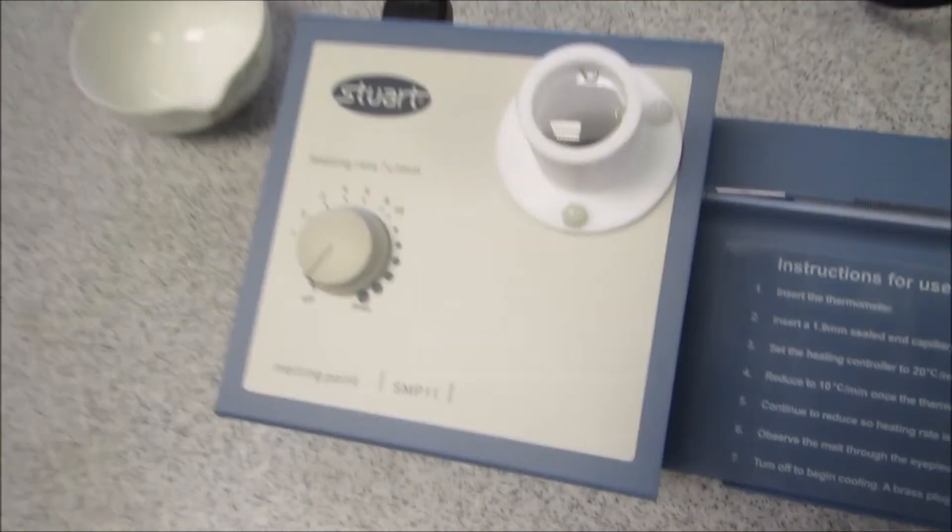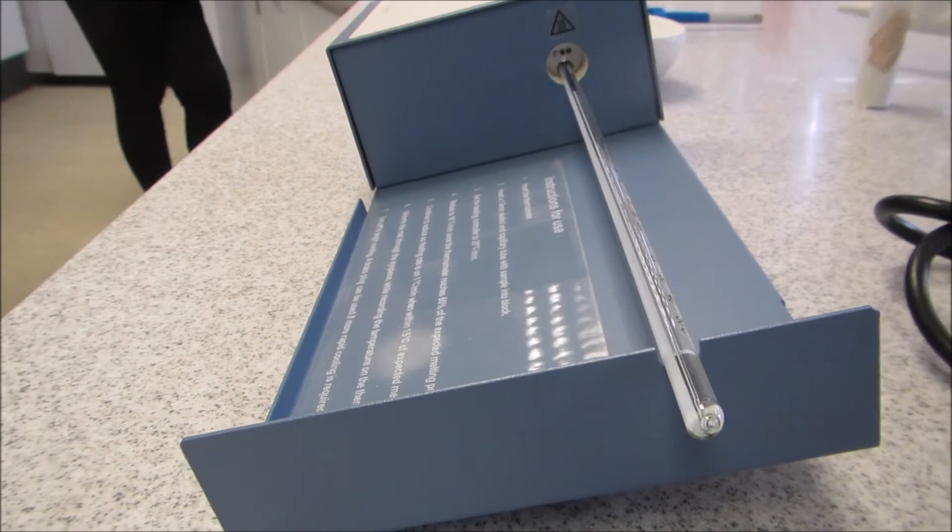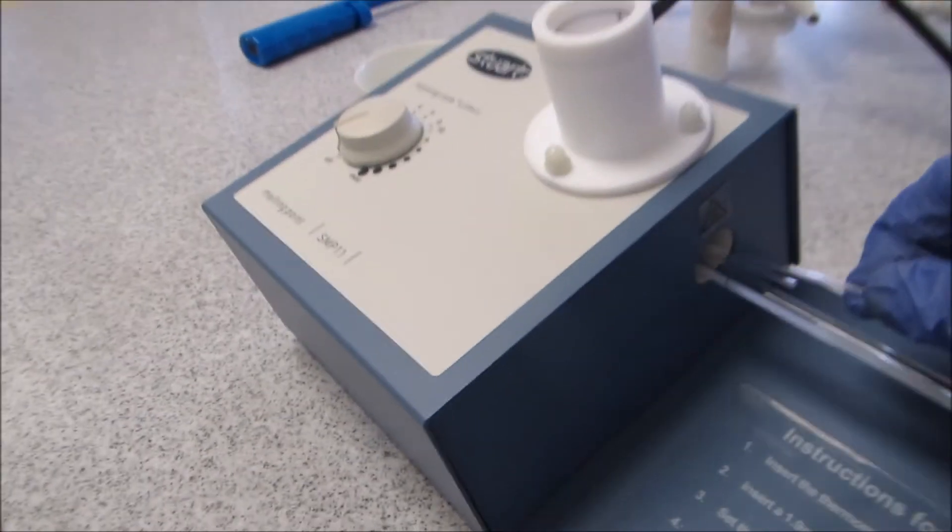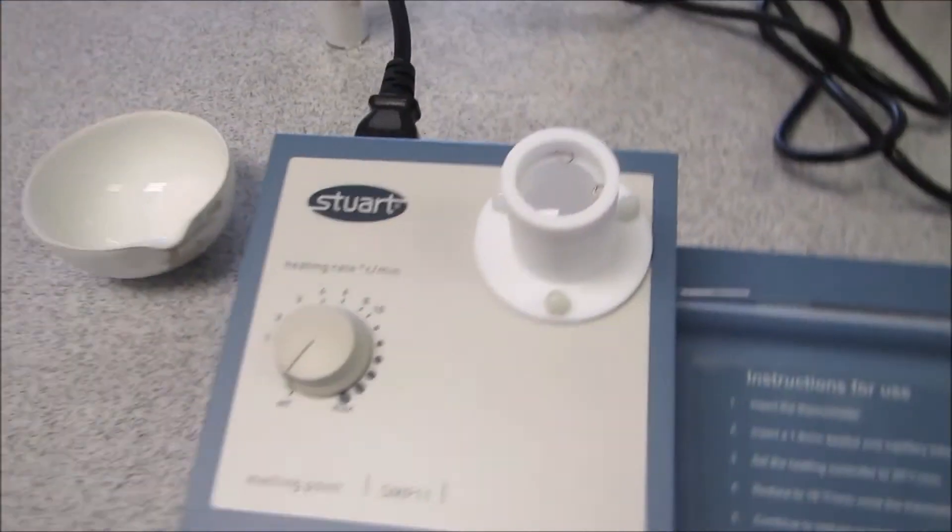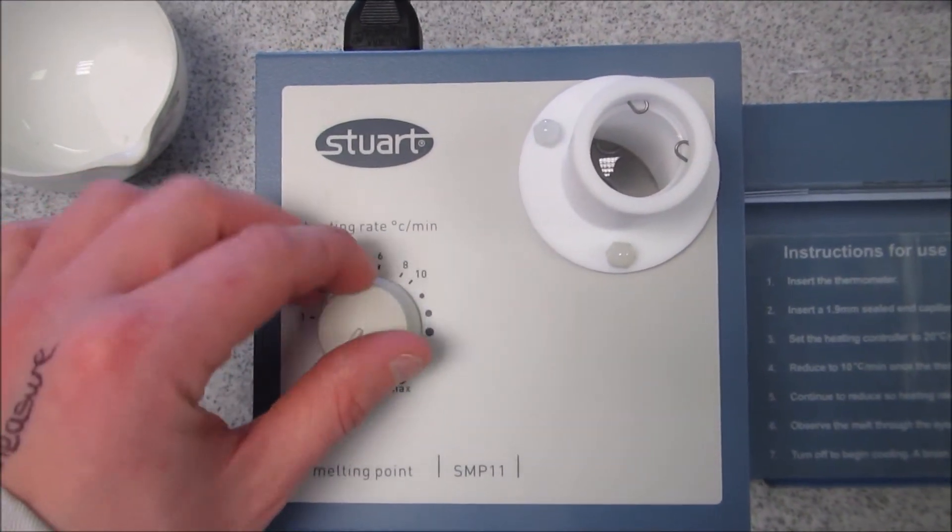So the next thing I'm going to do is take my melting point apparatus and put the tube in the side. So if I get it there, you can slightly see the thermometer hole and there's three small holes above it. I've already put one sample tube in that I've prepared with the aspirin and now I'm going to turn it on.